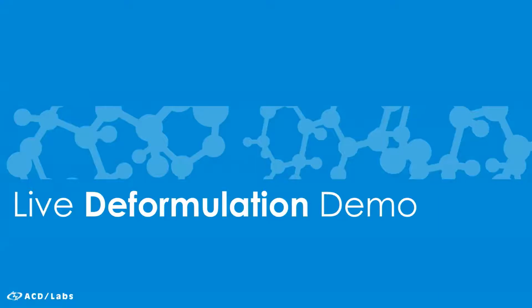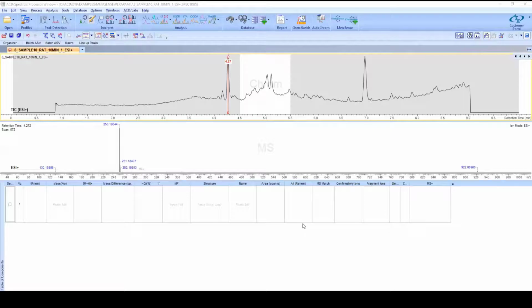Thanks, Nikki. So hopefully everybody is seeing my screen now. This would be our Spectrus Processor interface. And we're going to walk through those 3 steps that Nikki explained within the software, so you can see how things are actually functioning.